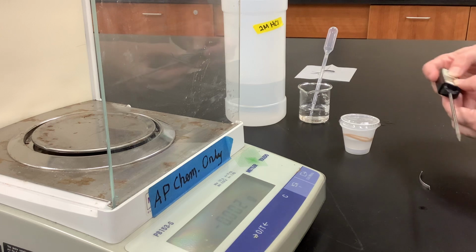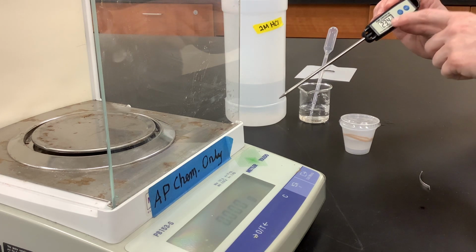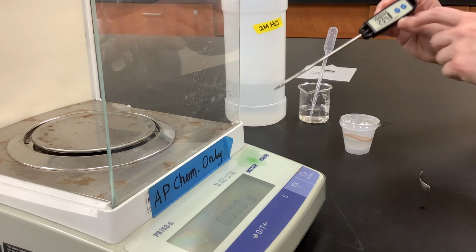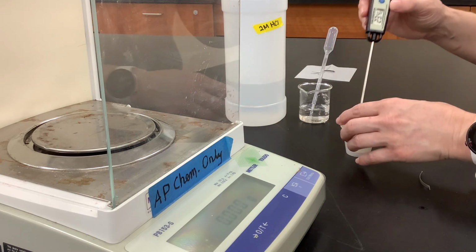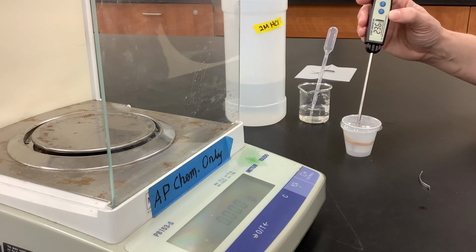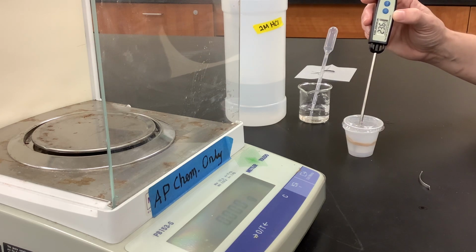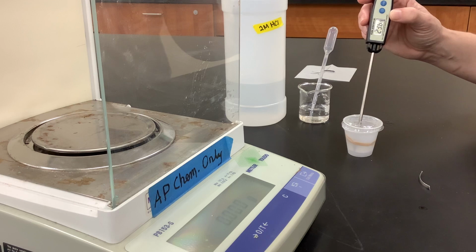I'm then going to take my thermometer, once again making sure that it's in Celsius, and take the initial temperature of the hydrochloric acid solution that's present. I'm going to give it a little time to settle. It looks like it's about 23.6 degrees C.